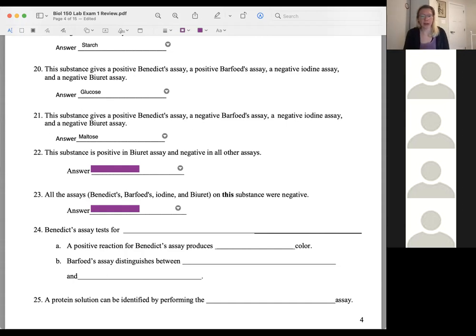And the biuret, I think it's one of the questions down here, what the biuret is actually reacting with. So we'll get to that in a moment. But these solutions chemically react with only certain unique chemical qualities of a given molecule. So that's how it will only change color if it's a protein and not something else.